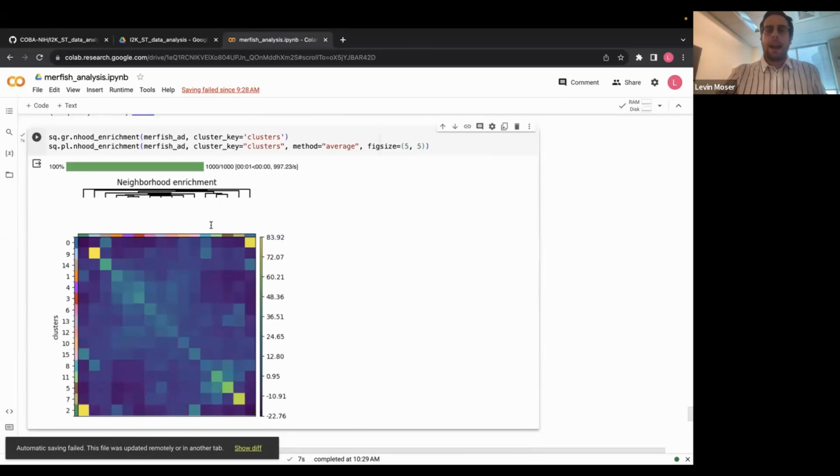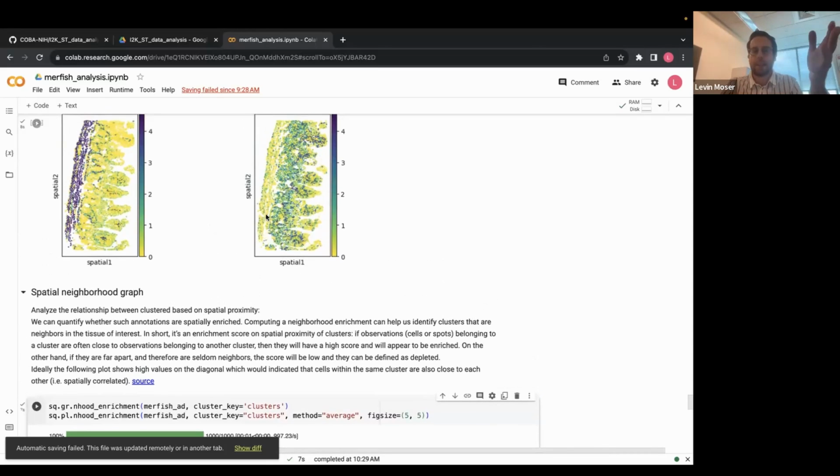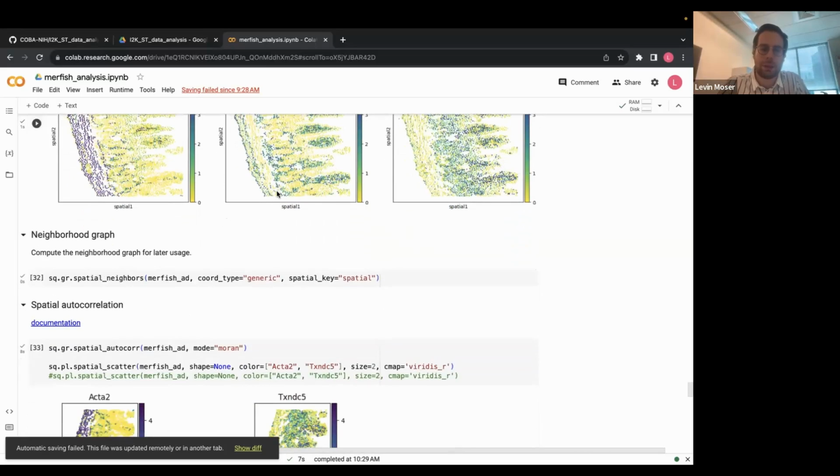And so again, we created a spatial graph, which is essentially just taking this spatial image, these XY coordinates of our cell, and then specifying, okay, for one cell, what are the neighbors of that cell? And that's how you build a graph over all of our tissue, by connecting these cells with each other.